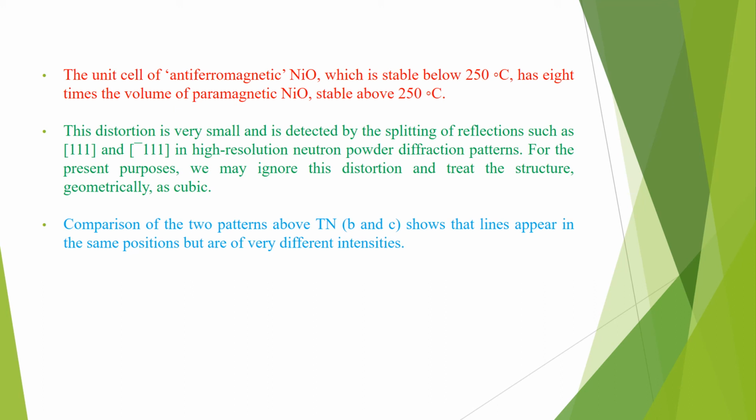The structure also shows a slight rhombohedral distortion, involving a contraction in the 111 direction perpendicular to the planes of ordered nickel 2+ ions.